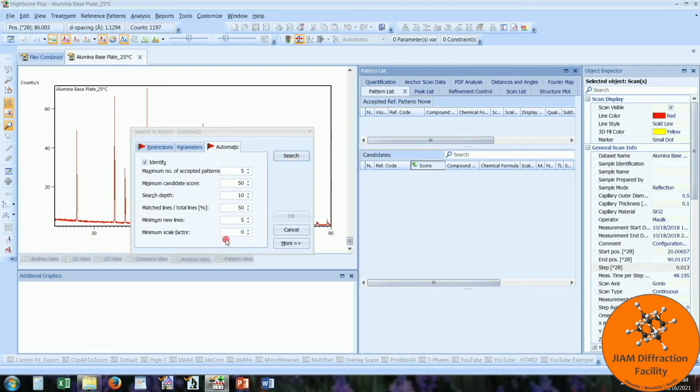Now these are just what I'm using for this video. This might not work out the best for you. Again, every situation is different, so if you need to, you are welcome to change these in order to better fit your circumstance.